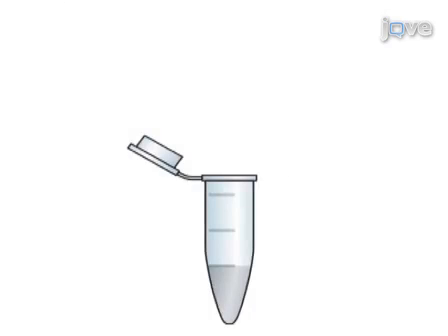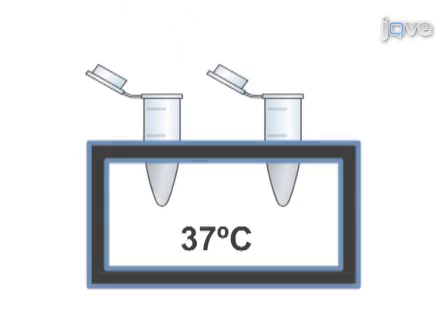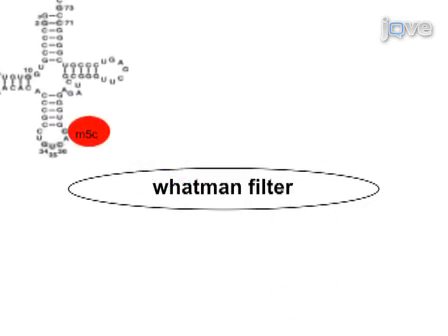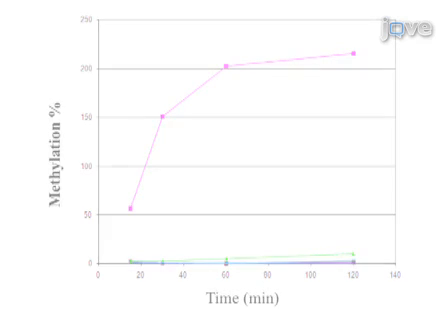Following preparation of the active enzyme, the Dnmt2 enzyme and the tRNA asp are mixed. The reaction is then initiated by adding the radiolabeled S-adenosylmethionine cofactor. The final step of the procedure is to stop the reaction and to separate labeled tRNA asp from unincorporated cofactor. Ultimately, results can be obtained that show the incorporation of the labeled methyl group into the tRNA asp substrate.